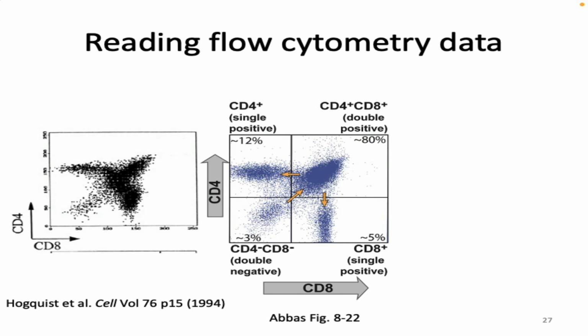And I'm not going to necessarily tell you you should have the quadrants or you shouldn't. I'll make them right now. I usually don't care if you actually have the quadrant lines or not. But what you can see in this plot is that the population of cells in this quadrant is pretty rare. It's the smallest percent at 3%.